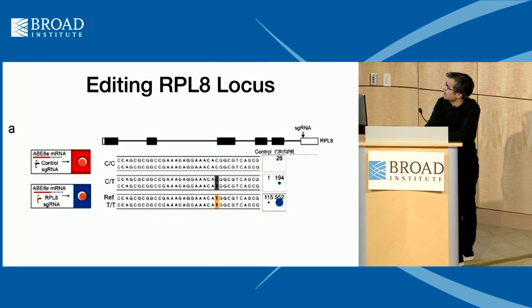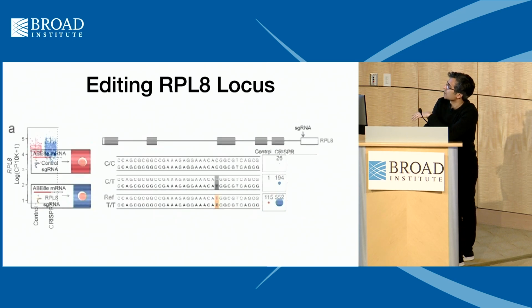We assayed, again, about 700 or 800 cells. And at the bottom, you see the reference individual. Those are the majority of the cells that we failed to edit, again showing you how inefficient things can be. In the middle, you see the heterozygotes. That's a subset of about 194 cells. And then about 26 cells, you get both alleles in. So you see the allelic spectrum.